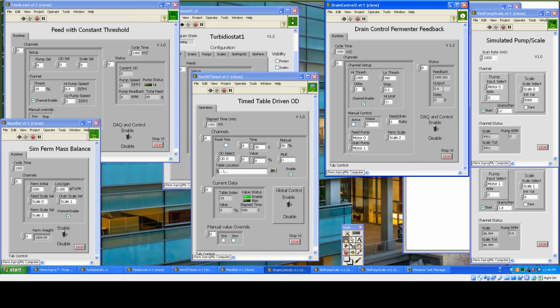And we'll watch this 1 or 2 times. There we basically are. Obviously things are moving much more slowly now, because of course the only difference is being driven by this constant gain of 0.3 grams per minute. And so what's happening here is every so often the drain pump turns on quite slowly just to keep the thing close to 1005. So at this point, the system is in steady state.